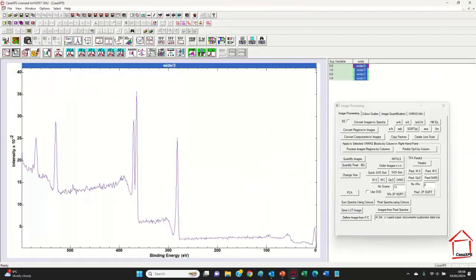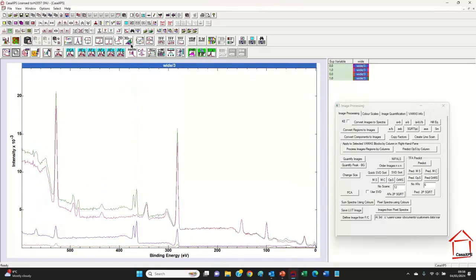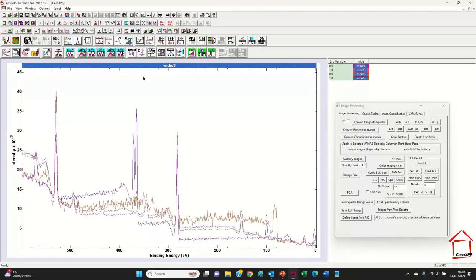Let's have a look at what we've got. Let's normalize these. This is a Euclidean norm. Must have the same number of data channels in each spectrum to apply a Euclidean norm, and we certainly do have that, so that was applicable for these data, and I end up with four spectra, two very similar, two very different, representing gold, silver.